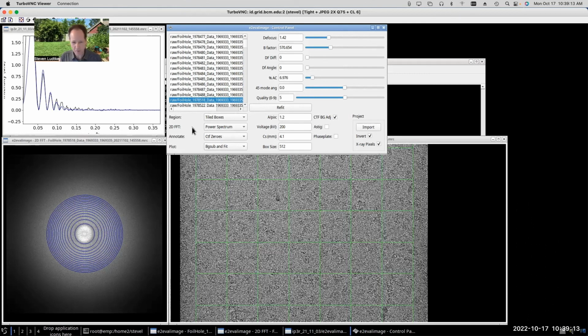All of these different factors basically come through as degradation of the signal at higher resolutions. And the noise actually decays at higher resolution too, it just doesn't decay as fast as the signal does, because some of the noise sources are not dependent on that. Is that enough? Yes, thank you. Okay. Thanks.